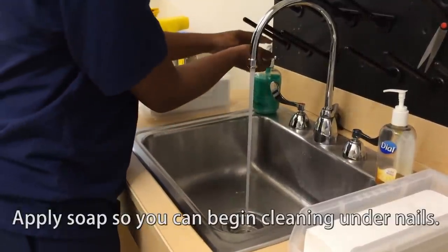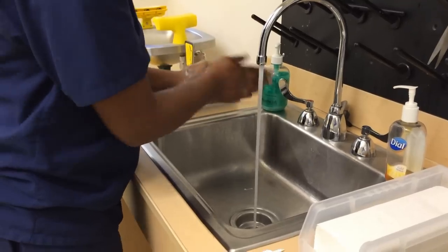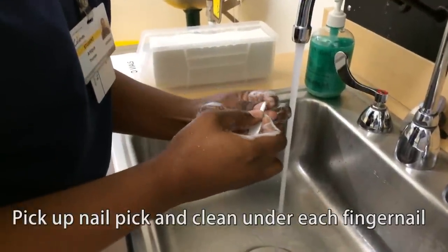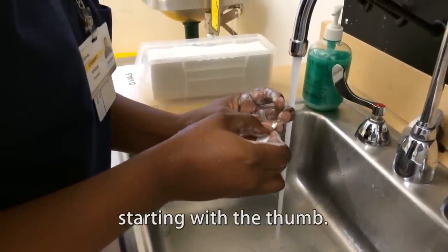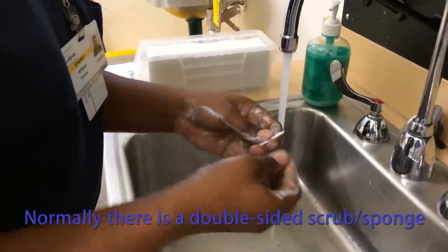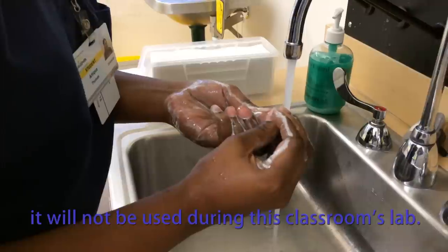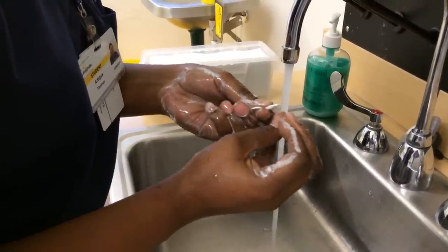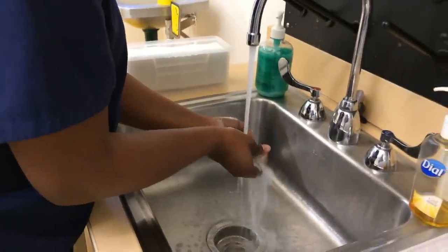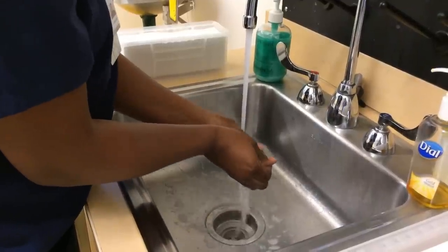Apply soap so you can begin cleaning under nails with a nail pick. Pick up the nail pick and begin to clean under each fingernail starting with the thumb. Rinse, then take the nail brush.